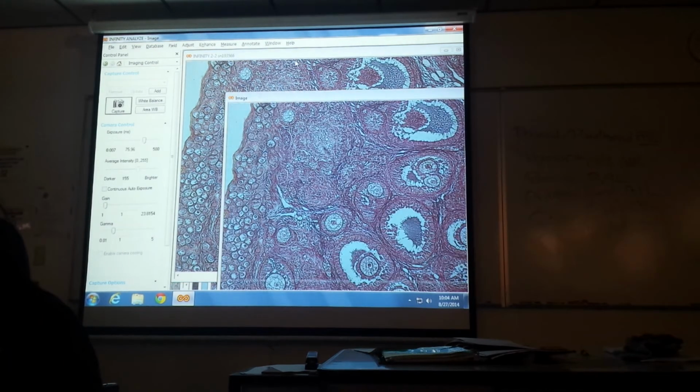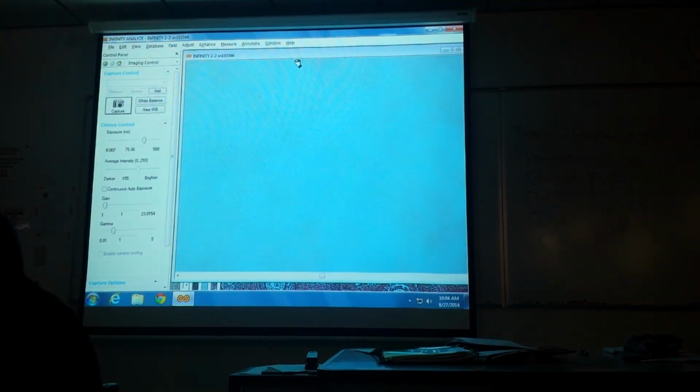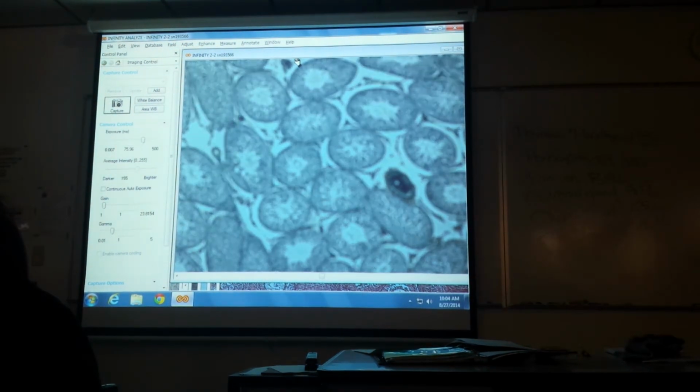Let's move on. Testes. From rat. We study testes because, well, what's the sex hormone in this organ? Testosterone.